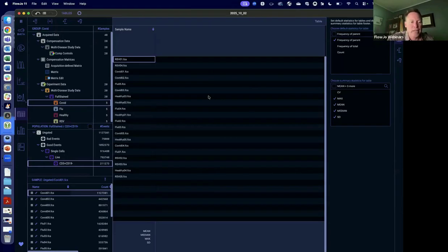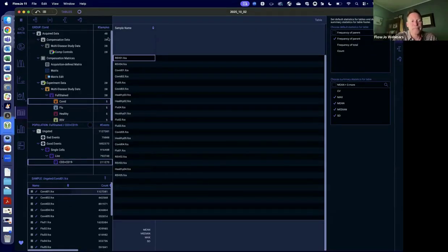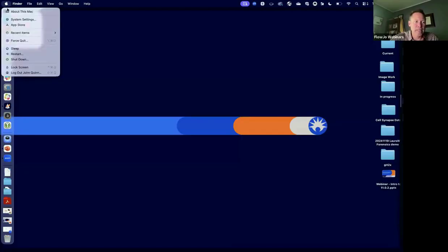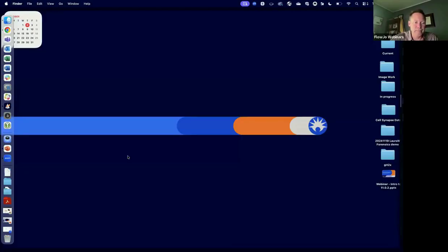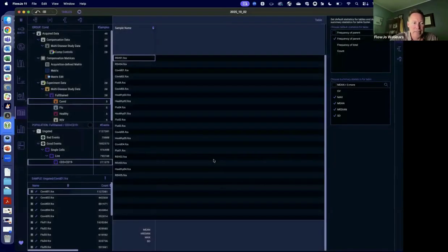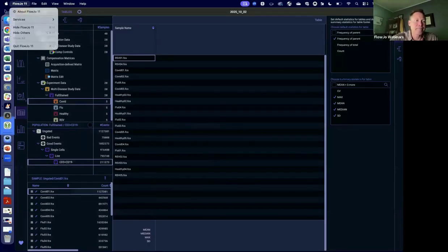Oh, and I'm running out of time. I might just get the spinning color wheel of death. Well, geez, sorry, we've slowed down in the last 5 minutes here to a crawl. I might need to force quit this to make sure we get something done. Yeah, it is bringing up the save. Maybe it's done thinking. Well, let's try. No, I got the force quit.